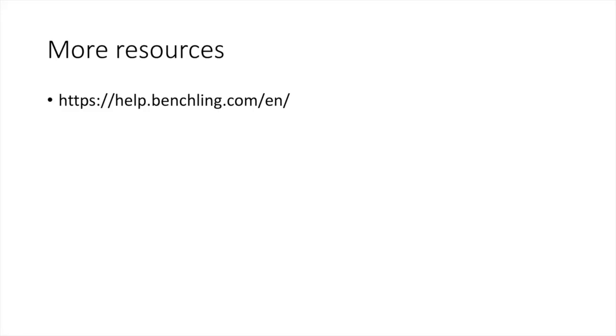The next two videos in this series will go into more detail about how we would use Benchling for scenarios specific to our work, including stem cell editing. If you need more resources on how to use Benchling in general, I highly recommend going to the Benchling support site, as shown on screen, which has video tutorials for all sorts of basic tasks.